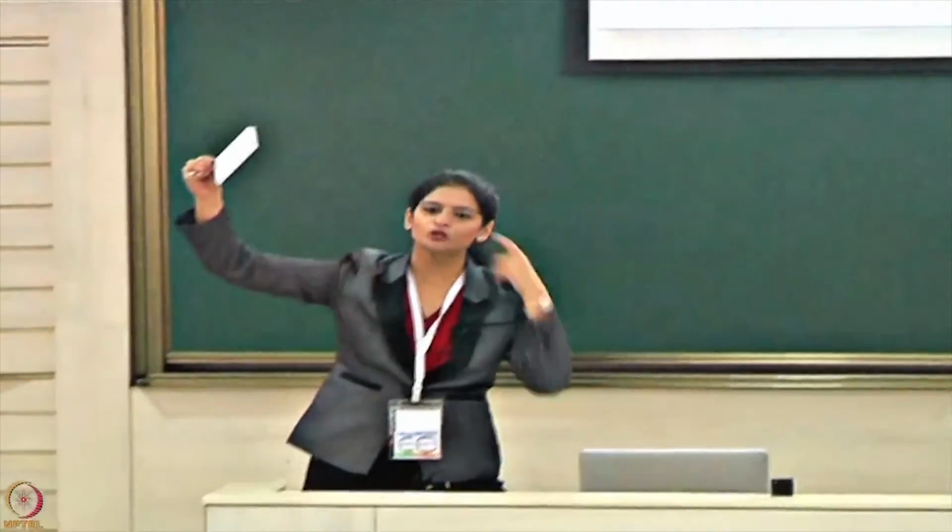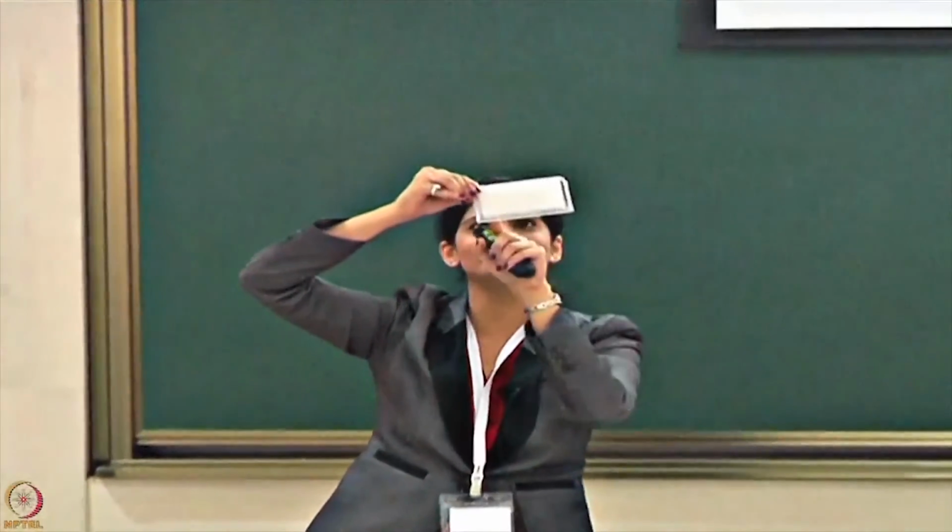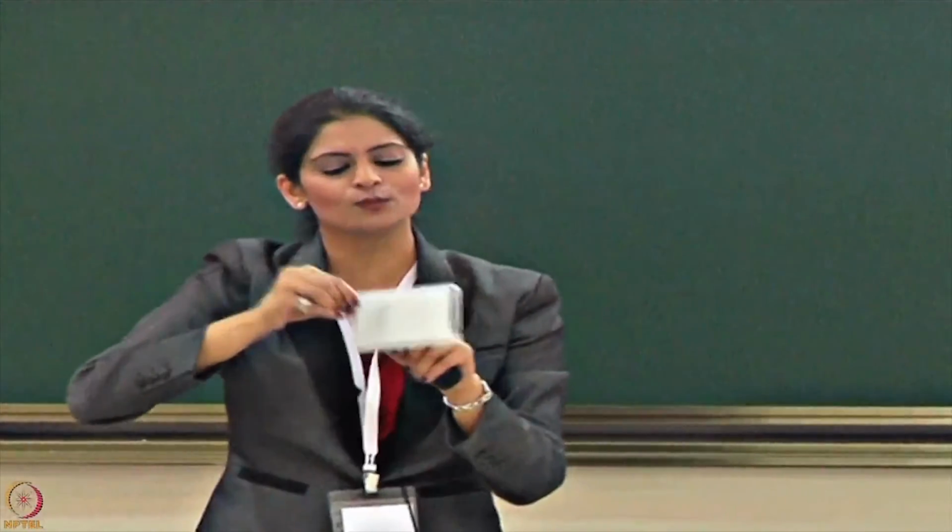If you fill all the wells, sometimes the human eye cannot really see if all the wells are full or not. I have had my own experience where, pipetting so many different samples in the 384 style, if you miss one well and you put that plate in a reader, what's going to happen to that one antibody? It's not going to print. It's not going to get picked up. It's not going to get detected. So you've missed the whole set. You'll have to go back, fill it again and start.